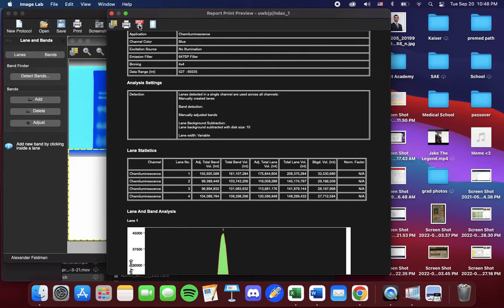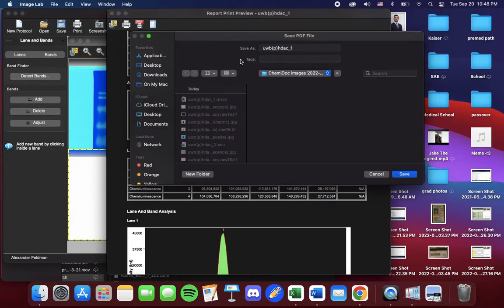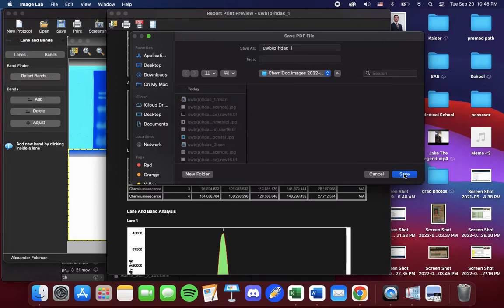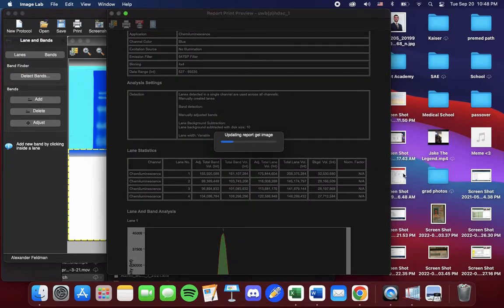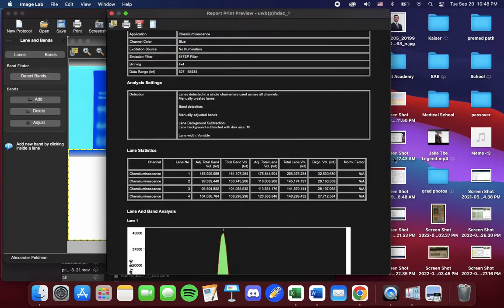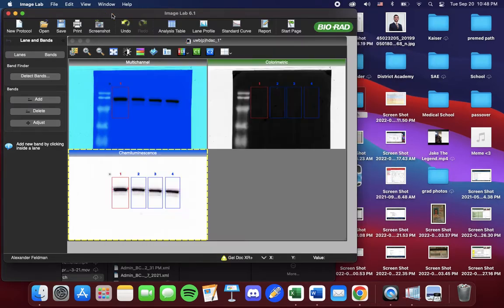So to save the file, go to the top left corner under PDF. And it will save it to the same folder which your images are saved on. So you press save. Now that we've saved it, we can exit out.